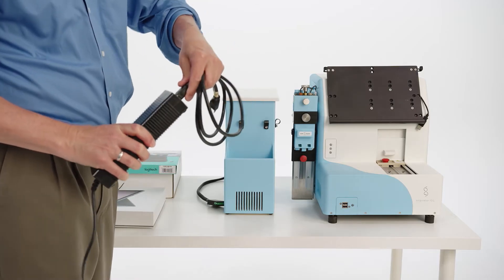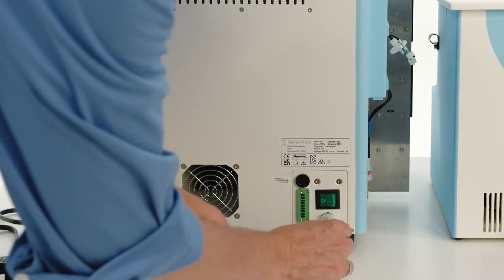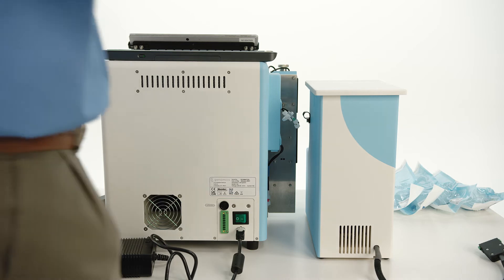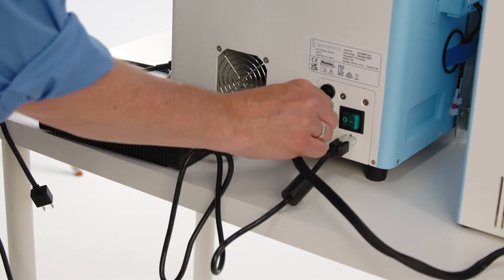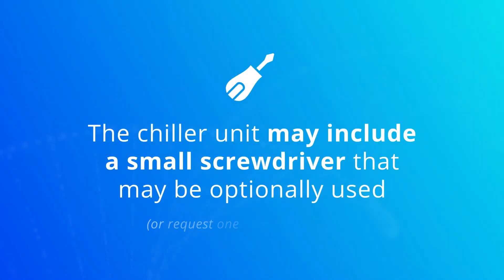Connect the Singulator power supply to the plug cord and then connect the white connector to the receptacle on the rear of the Singulator. Connect the reagent chiller to the Singulator with the thick cord and green connector to the rear of the Singulator. Be sure there is enough clearance behind the Singulator to allow for a secure connection. The chiller unit may include a small screwdriver that can optionally be used to securely attach the chiller unit cord, or you can request one from S2 Genomics or your distributor.